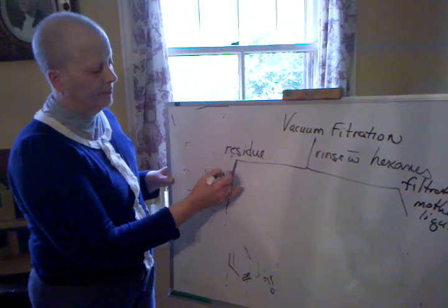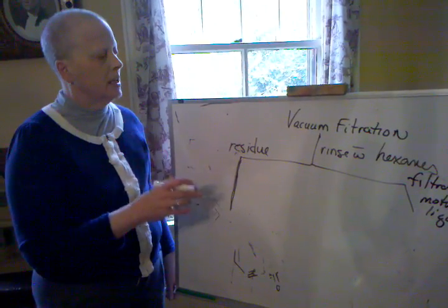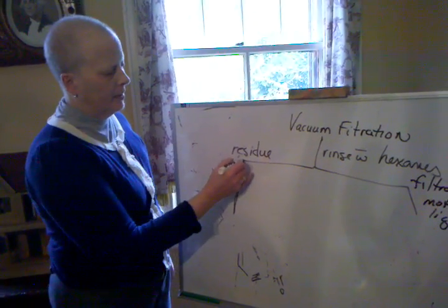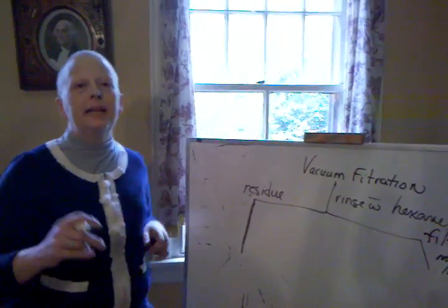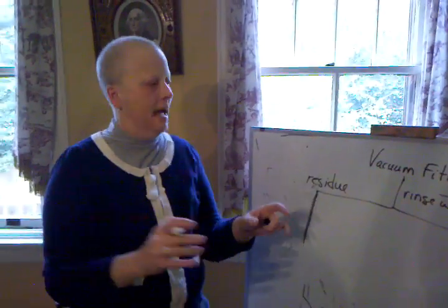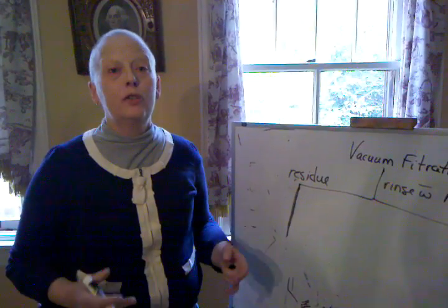The residue, this is our crude solid. The problem with this crude solid is that there's not one solvent that you could commonly use that would work for this. In other words, I can't find one solvent that's commonly available in the lab where this residue would dissolve when it's hot and come right out when it's cold. So we're going to use a system of two solvents.